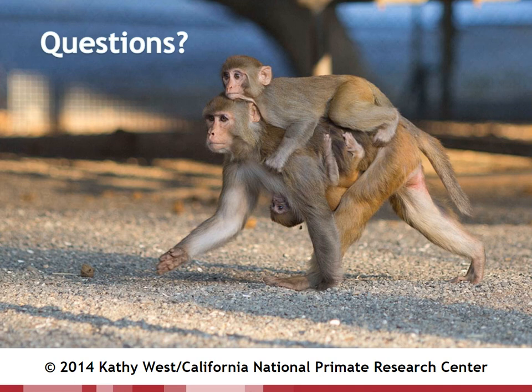We do, so it's very easy to see them on our recordings, and there is a way to quantify spindle activity. You have to use MATLAB, and then there is a specific algorithm that you can download online that will automatically quantify spindle activity in your EEG recording, including if you're using the DSI model, the extracts from the Ponemah software. You can use MATLAB to quantify spindle activity as well.